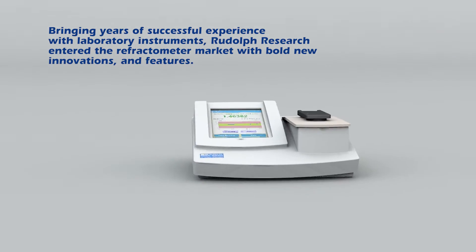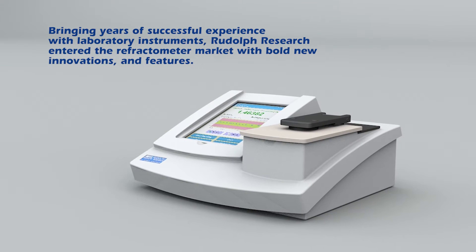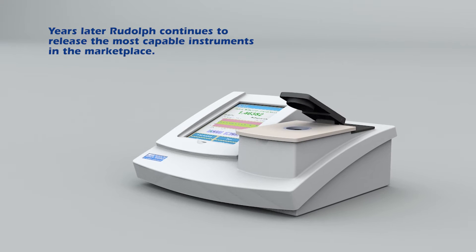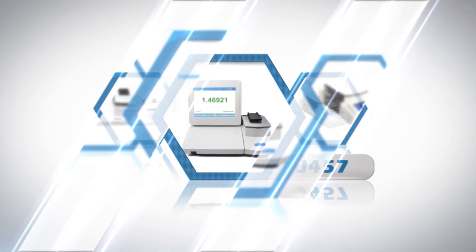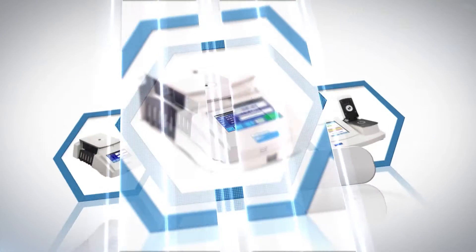Bringing years of successful experience with laboratory instruments, Rudolph Research entered the refractometer market with bold new innovations and features. Years later, Rudolph continues to release the most capable instruments in the marketplace. Today, I'd like to introduce you to the most innovative line of laboratory refractometer instruments made today.